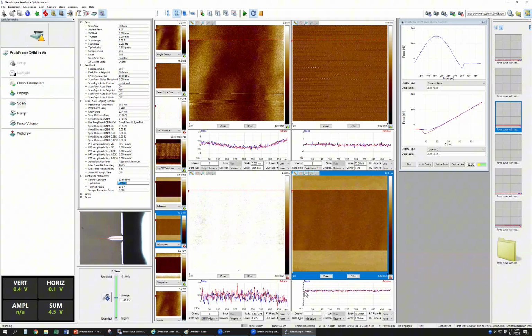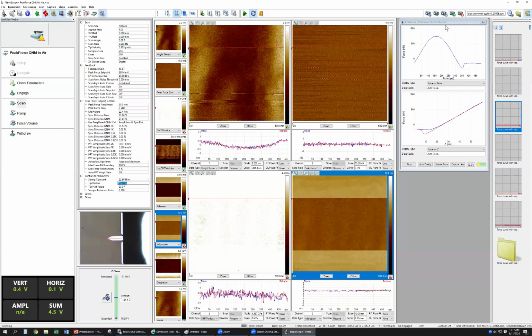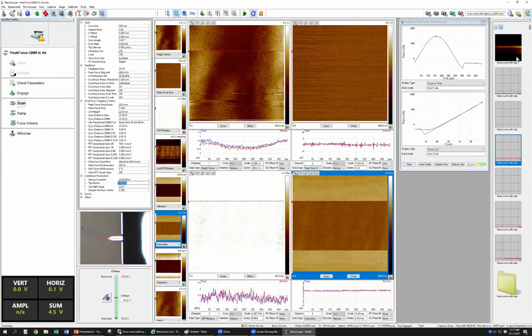Okay. So that's how to calculate this one. Then you just go from the top to down and get one image. You collect this image, no need for this first curve. You just collect the image enough. If you collect the full image, you use this one, waiting for it to go down. If you just collect a little bit, because I already know this depth is around here, then the force is around here, right? Okay, I just capture now.